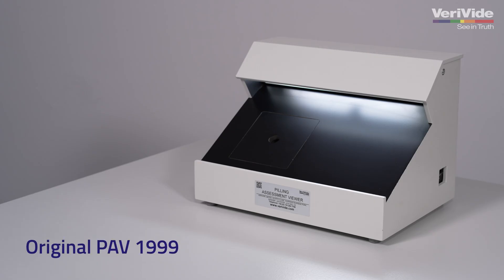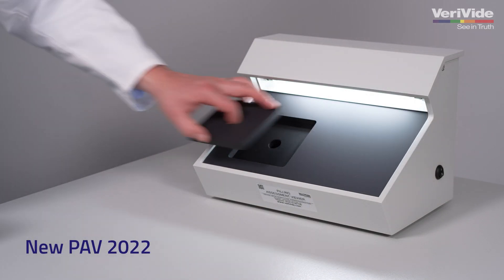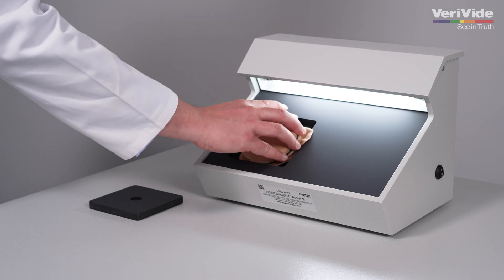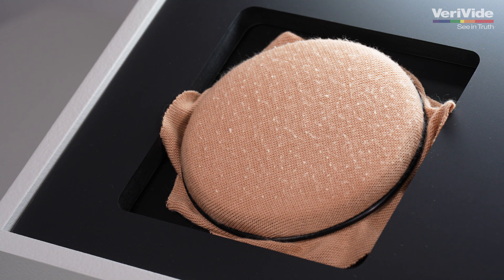The Pilling Assessment Viewer was launched in 1999 and has been through multiple facelifts since its original design. A key feature of the PAV unit is a recess for a modified Martindale specimen head, enabling samples to be viewed easily whilst mounted on the head.